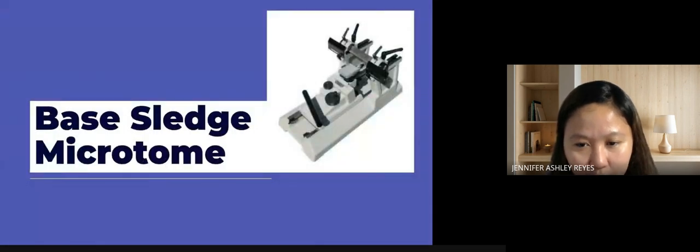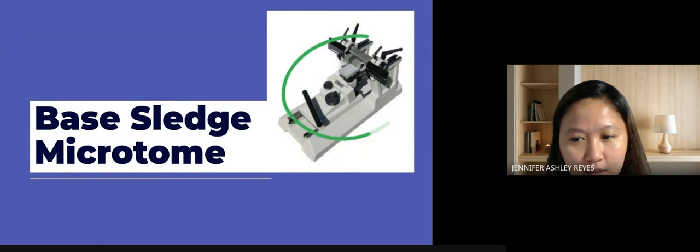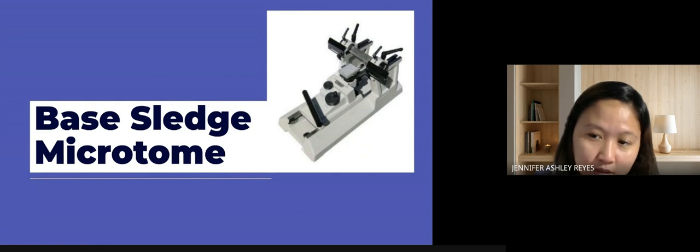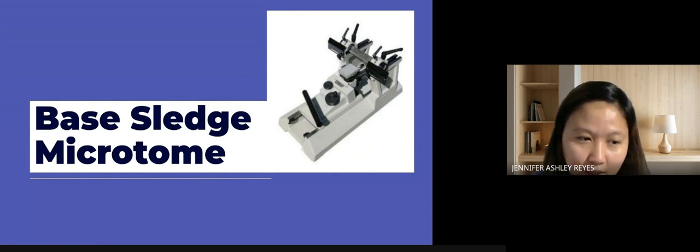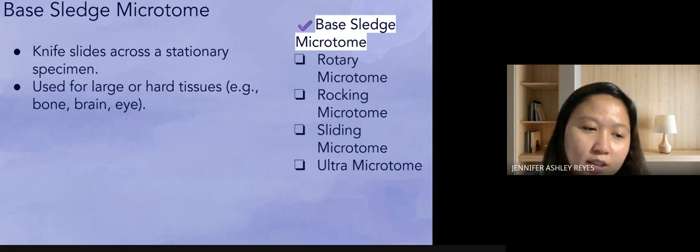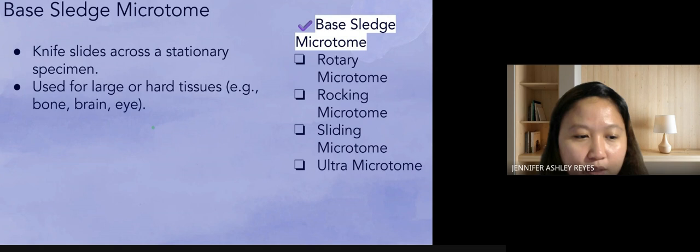This one naman is the base sledge microtome. This is a heavy duty cutter. Unlike rotary types, the knife moves and the specimen is stationary. You can use this for larger or harder tissues like bone, brain, and eye. It's sometimes preferred in neuropathology and research settings.